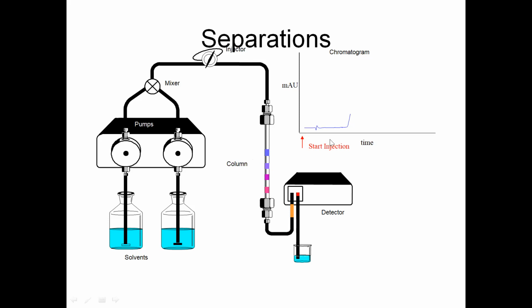Now you see this compound is in the detector, you can see a peak. And the second compound is going to the detector. Now you see the second peak is detected, and the second compound in the detector, you can see the second peak.